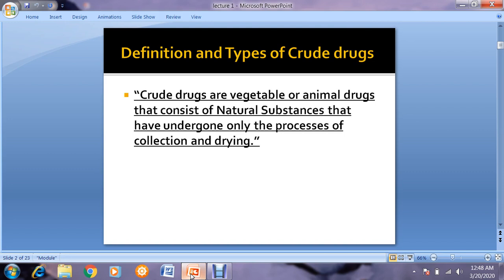Crude drugs are vegetable or animal drugs that consist of natural substances that have undergone the process of collection and drying only. Natural drugs may come from the plant kingdom, animal kingdom, marine microbes, and mineral sources. Here in our lab, we are just performing the evaluation of drugs coming from the plant kingdom.